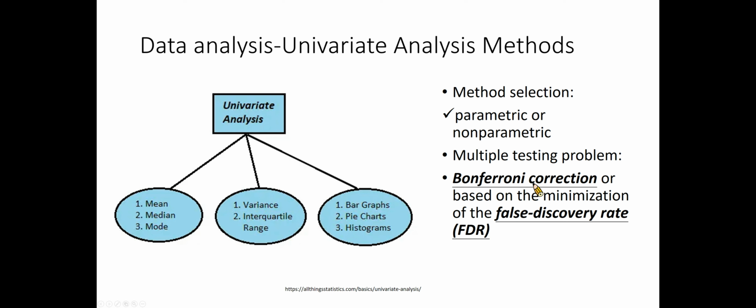In the Bonferroni correction, the significance level for one hypothesis is divided by the number of hypotheses tested simultaneously. Although a very conservative approach, especially when the hypotheses tested are not independent, many researchers advocate using a Bonferroni correction in metabolomic studies.